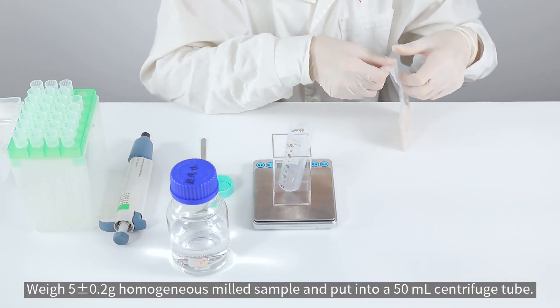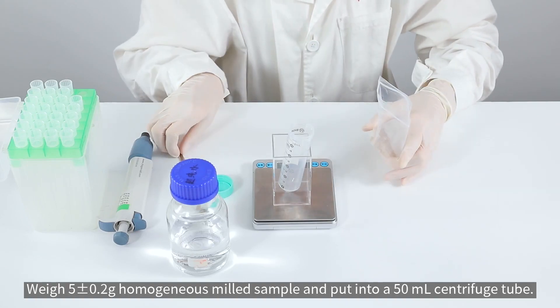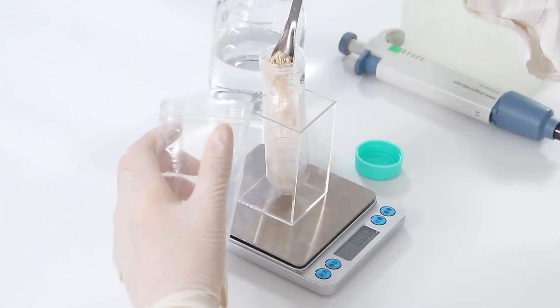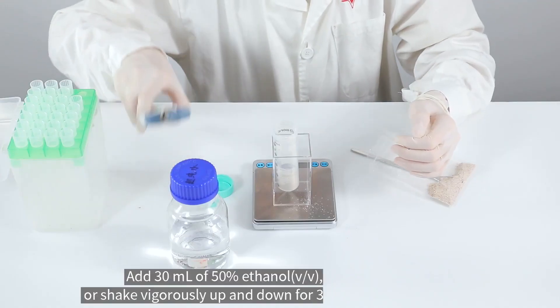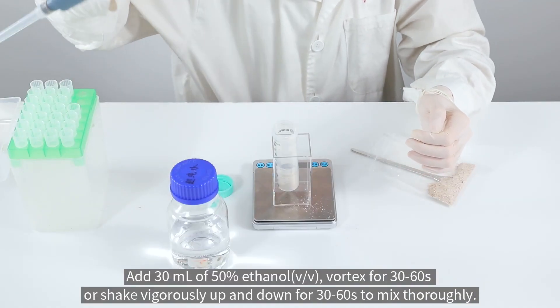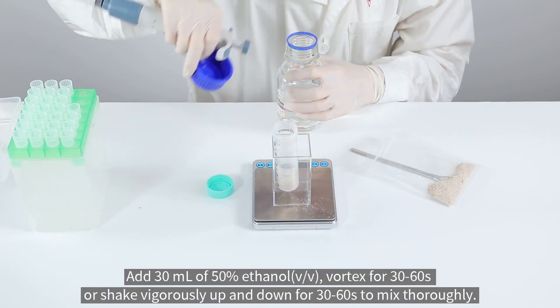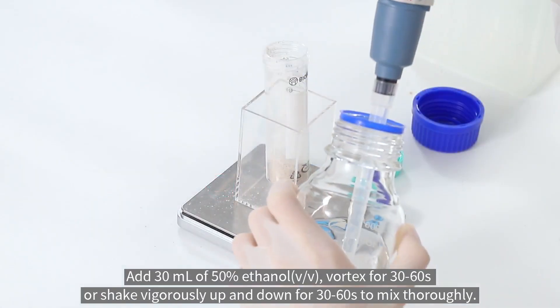Weigh 5 grams of homogeneous milled sample and put into a 50 milliliter centrifuge tube. Add 30 milliliters of 50% ethanol, vortex for 30 to 60 seconds, or shake vigorously up and down for 30 to 60 seconds to mix thoroughly.